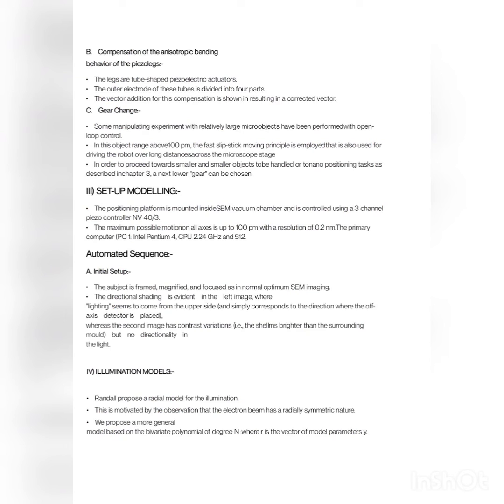Point B. Recognition of the probes and the nanowires. When the 4 probes and the one or multiple nanowires are in the field of view, they are visually recognized and identified. The probes and nanowires are distinguished by comparing the area surrounded by the contours. Since the nanowires have smaller areas, the 4 probes are distinguished from each other by comparing the positions of the centroids of the contours, and the positions of their tips are determined as either the highest or the lowest probe contour.